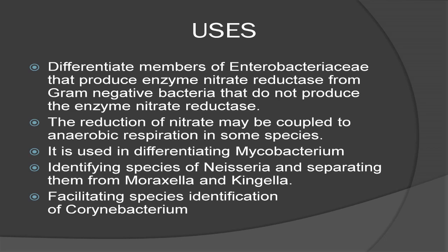Second, the reduction of nitrate may be coupled with anaerobic respiration in some species. It is also used in differentiating Mycobacterium, and also identifying species of Neisseria and separating them from Moraxella and Kingella.